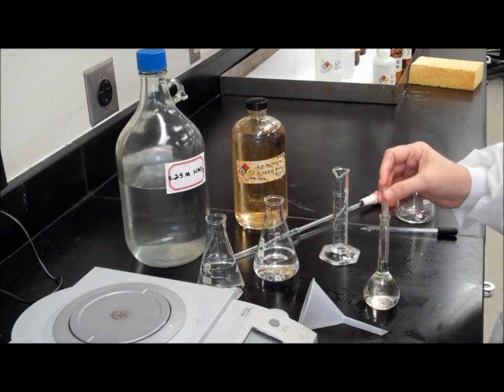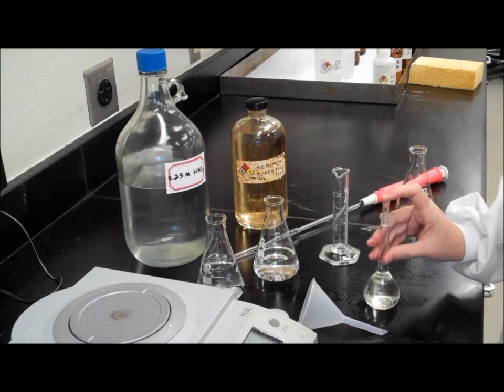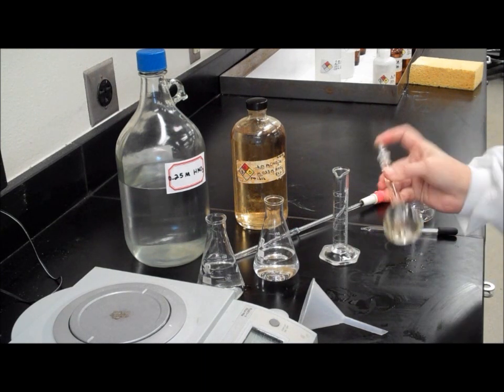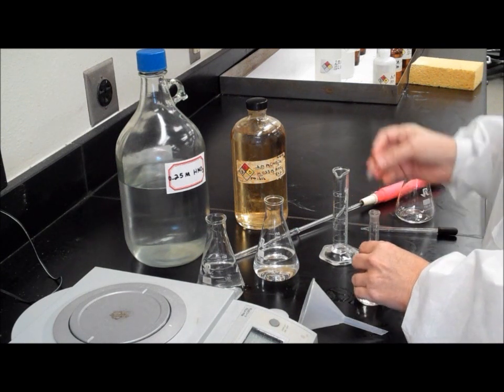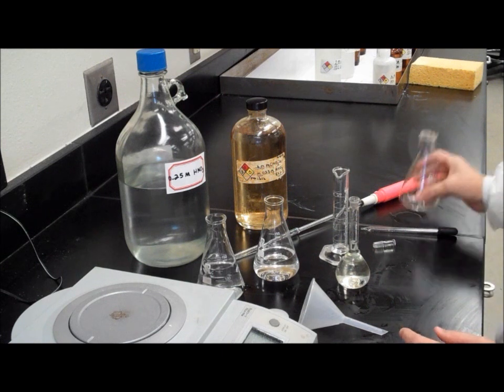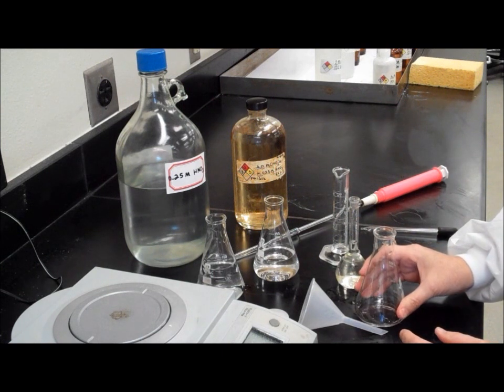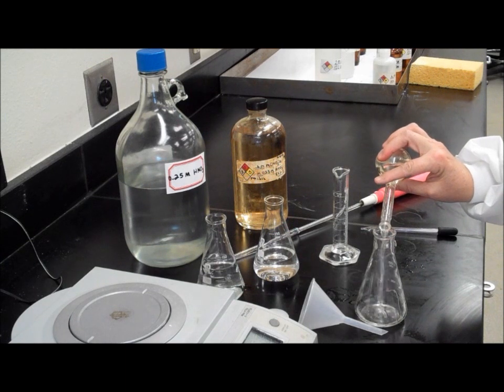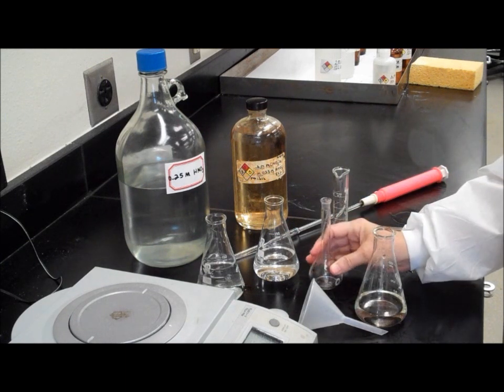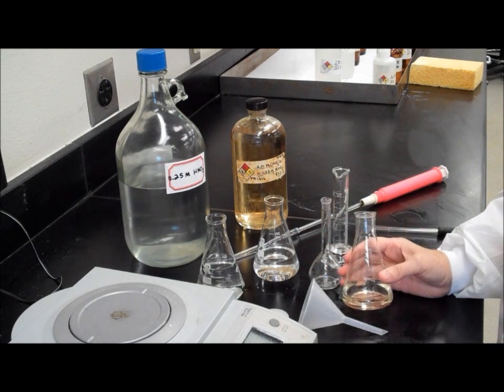Next, place the glass stopper in the top of the volumetric flask and invert once or twice to mix. You can then transfer the solution to an Erlenmeyer flask. Label this flask solution number one.